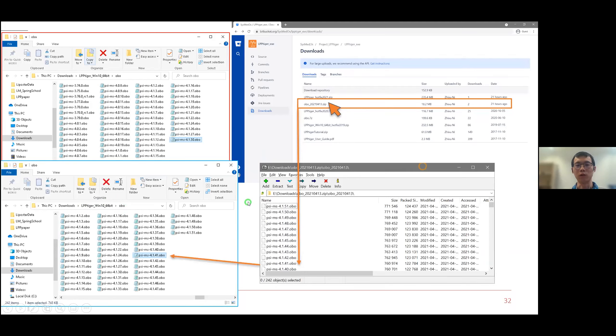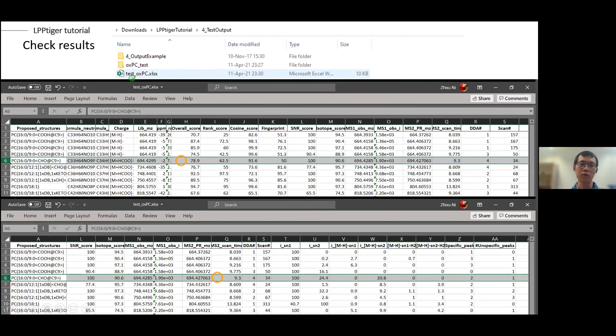Then we get our results. We can first open this summary Excel table. Here we can see the identifications and then the overall score, each separate score, and additional information. For example, the retention time and the relative intensity of main fragments.